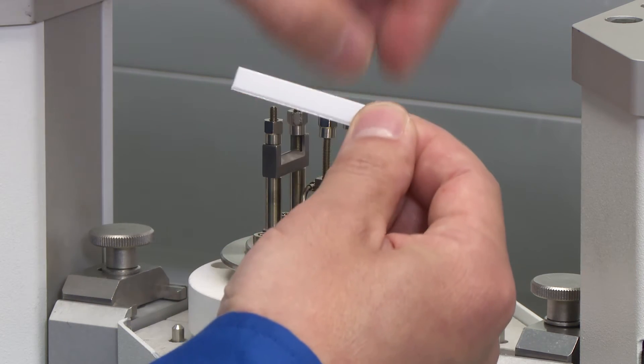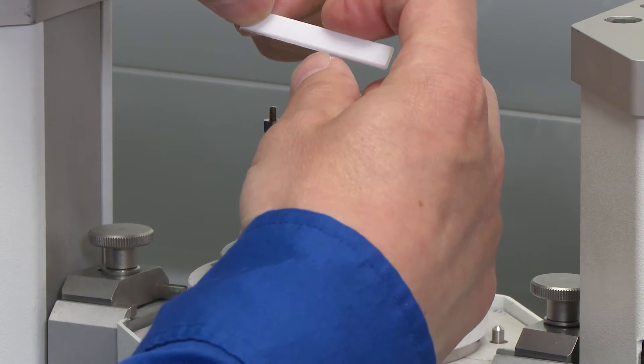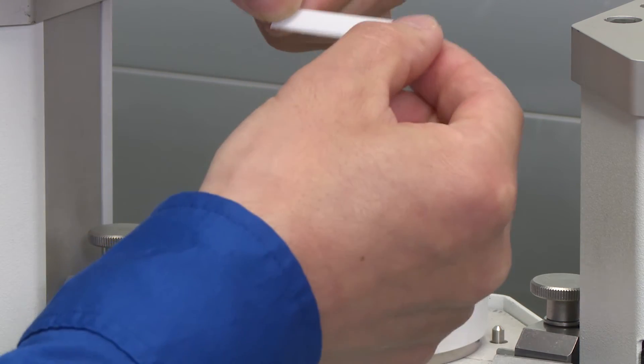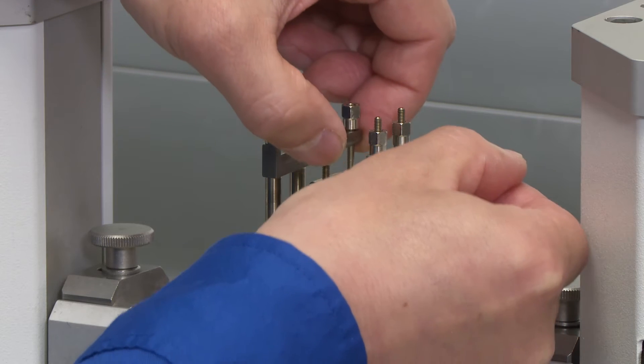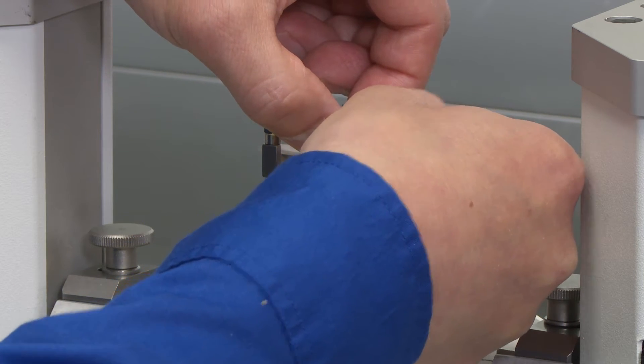Before sliding the sample in, we want to measure the sample width and thickness. Then we can put the sample in under the center knife.